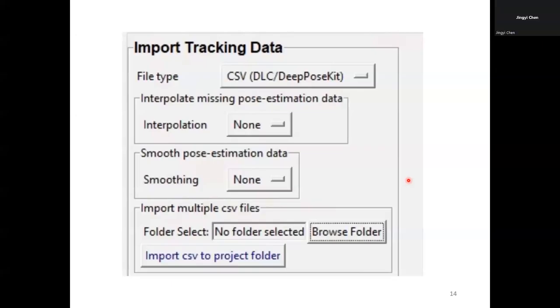That makes sense. Yeah. And I was also wondering if you have a recommended minimum frames per second for videos that you would consider when setting up the recordings. Yeah, so that's a really good question. And the answer, unfortunately, is that it depends a lot on what you're looking at. So for social behavior, I film at 30 frames per second, and that has always been fine.